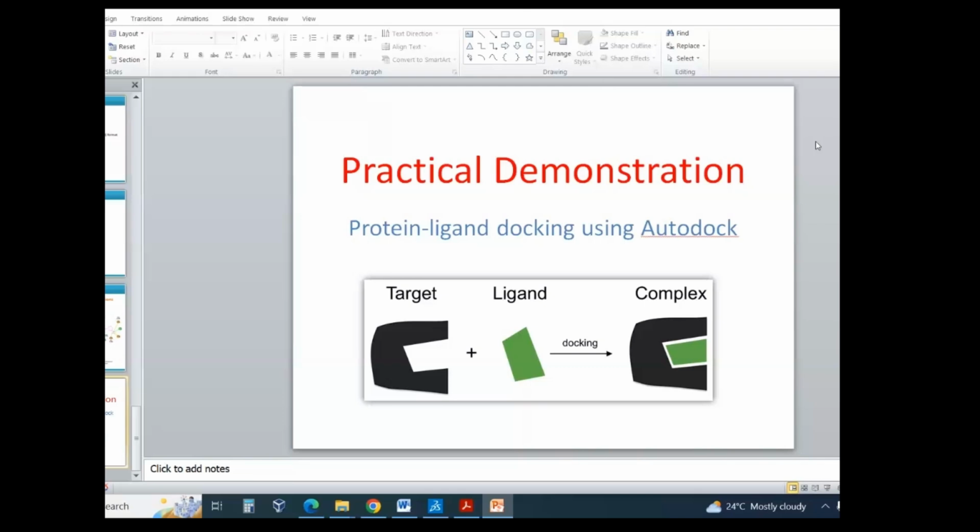But my enzyme is particularly binding to that single molecule only. Okay, that's great. So you can open that file in Discovery Studio Visualizer, or some preparation software. I think UCSF Chimera, which we are going to use for preparation, should recognize your SDF file format. So let's see how it works.